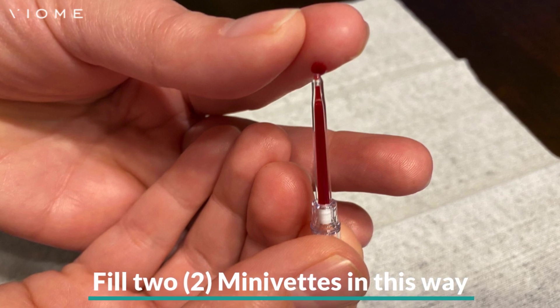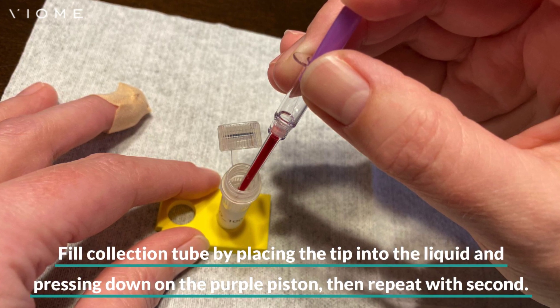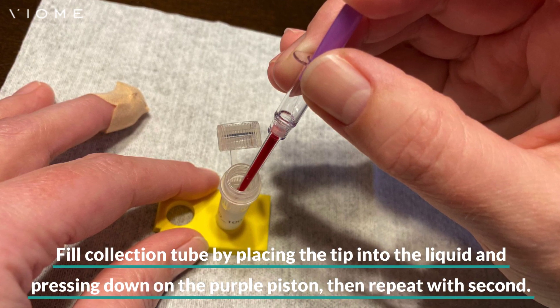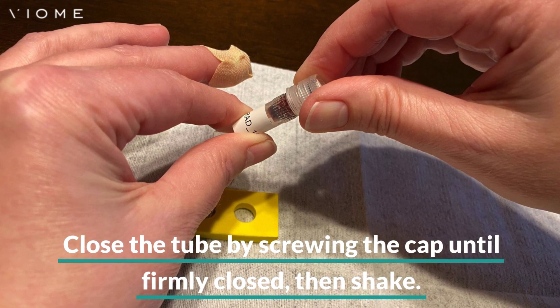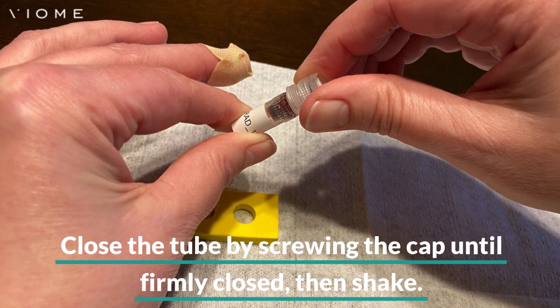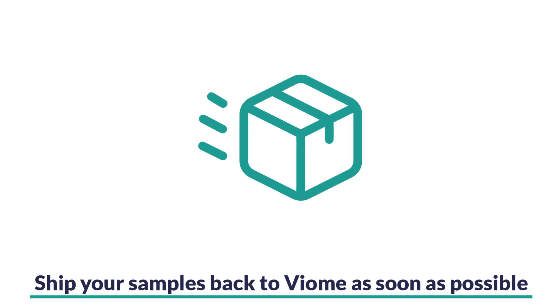Fill two minivets in this way. Fill your collection tube by placing the tip of one minivet into the liquid in the tube. Gently press the purple piston down to empty. Repeat this step with the second minivet in the same collection tube. Close the tube by screwing the cap on until firmly closed. Remove the tube from the holder and shake for 30 seconds to mix.